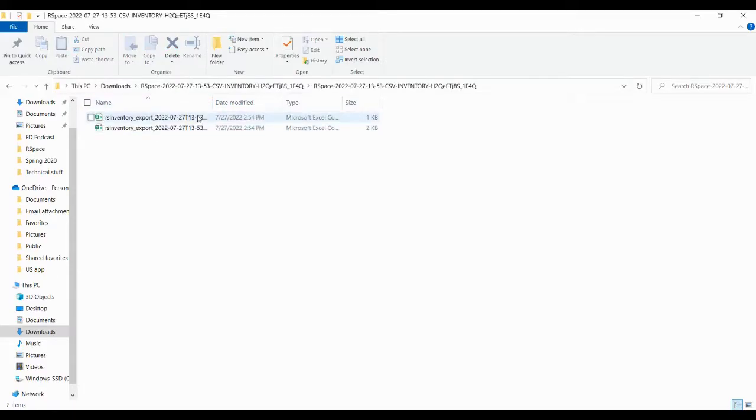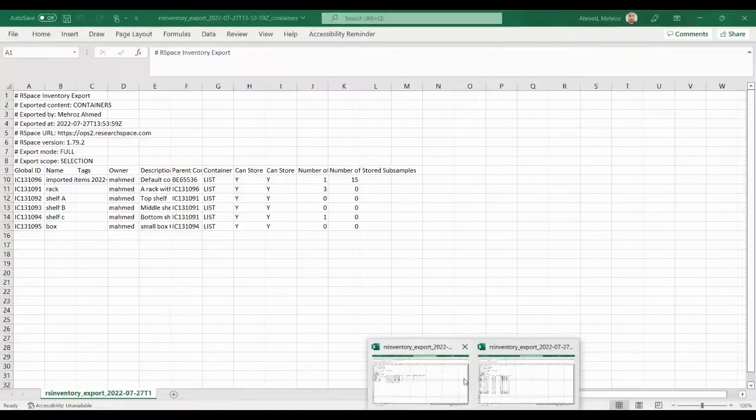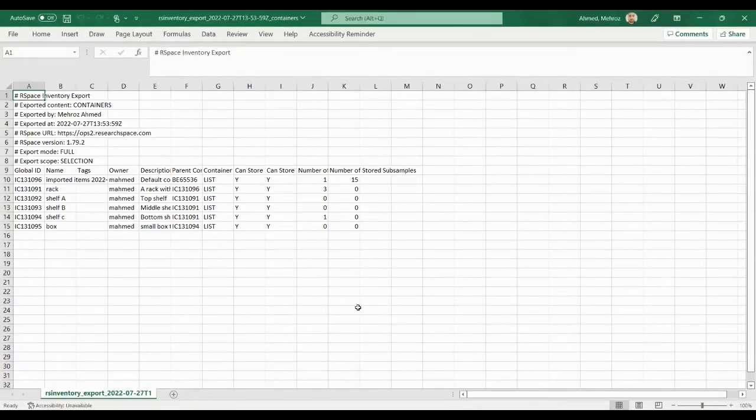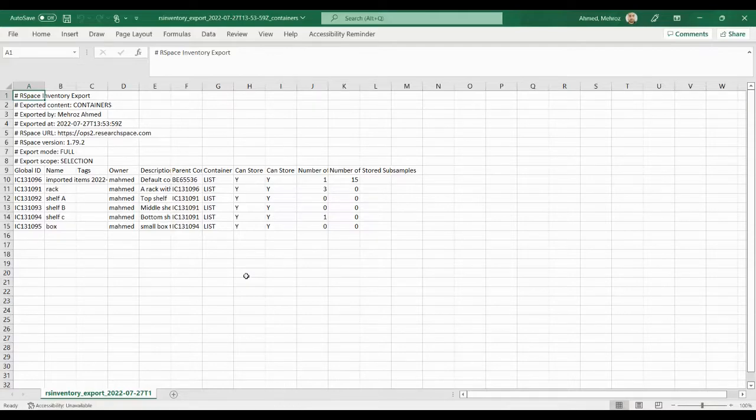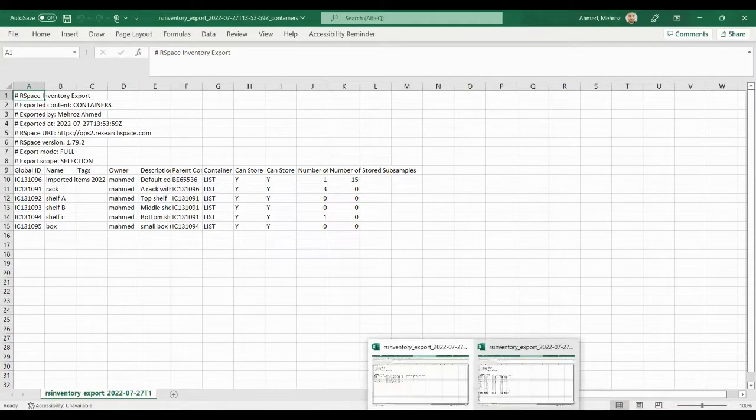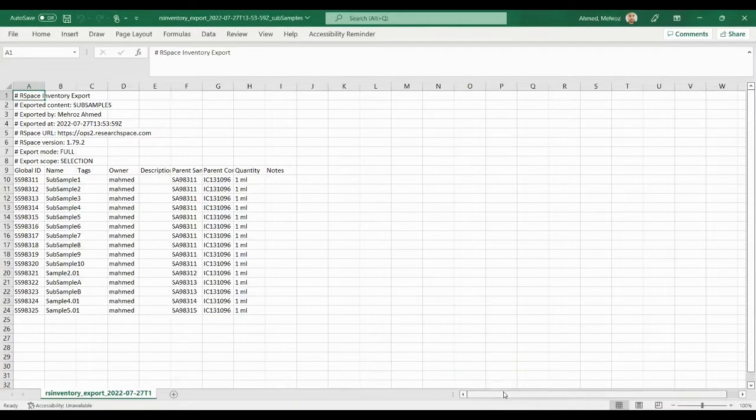Let's go ahead and open them up and you'll see that the files are sorted by the content type. This file contains containers whereas the other file contains sub-samples.